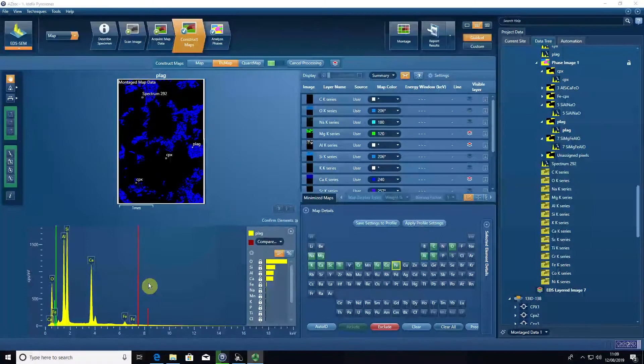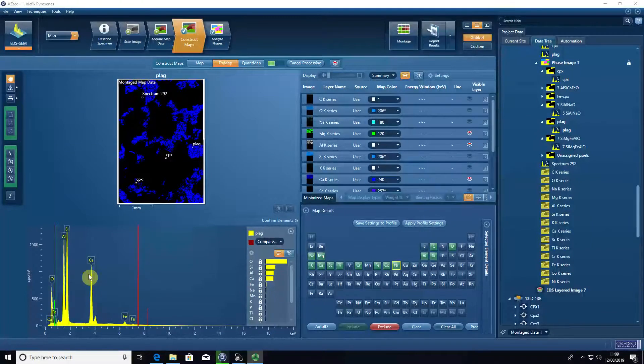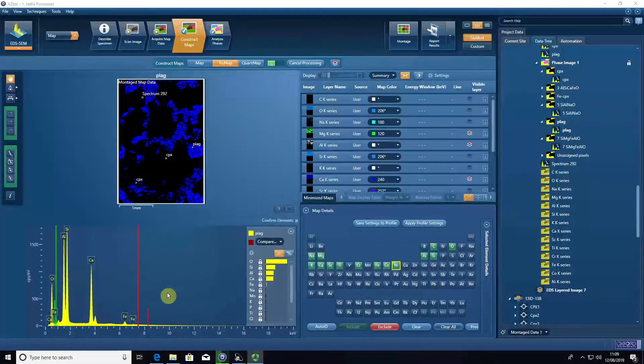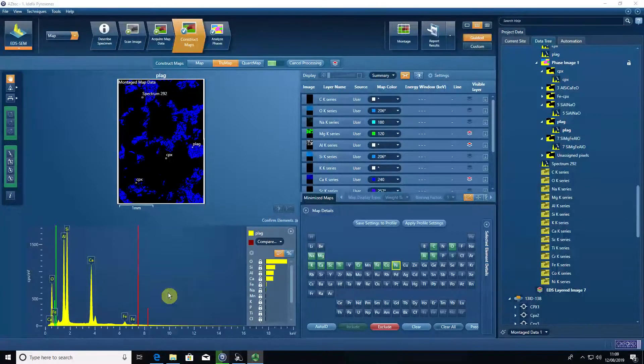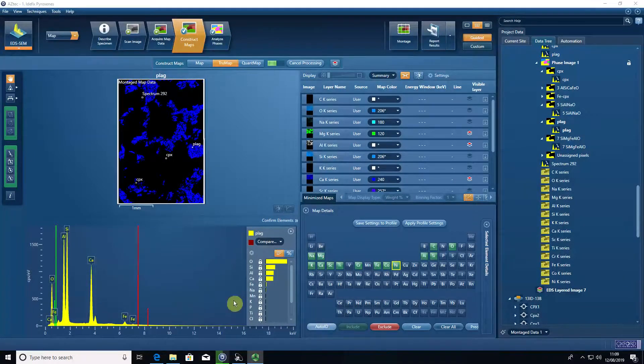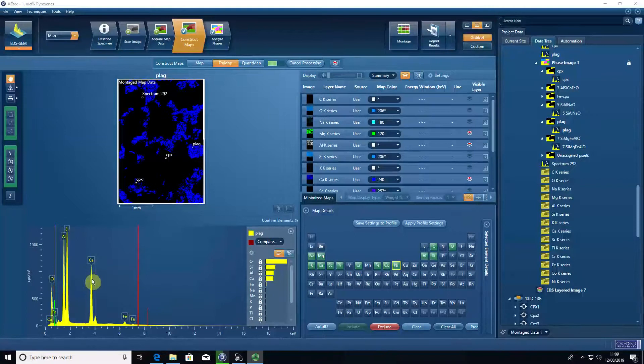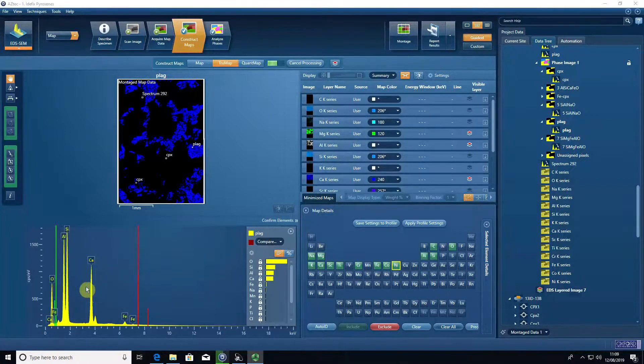But it's also a curse because if we rely on things like auto ID to identify the elements, then mistakes can creep in because there are such things as overlaps between different elements with different x-rays that share similar energies.